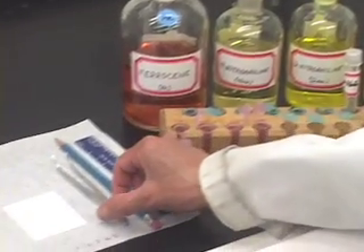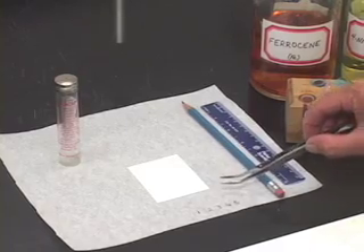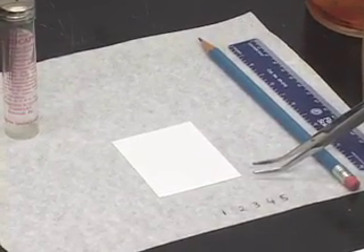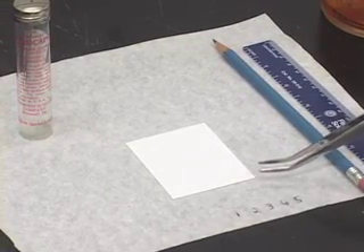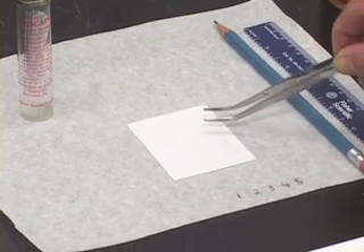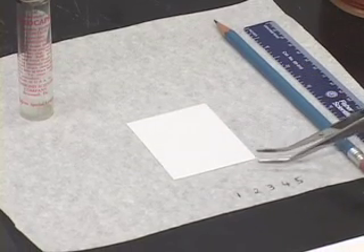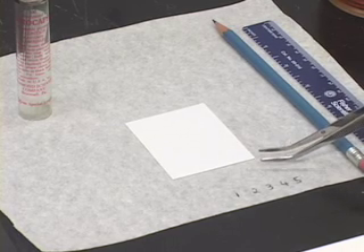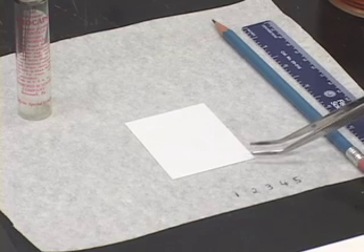The most important piece of equipment that we need for this experiment is the TLC plate, or thin layer chromatography plate. You notice that there is a white coating on this plate. This coating is made up of silica gel — a piece of plastic has been coated with this silica gel.